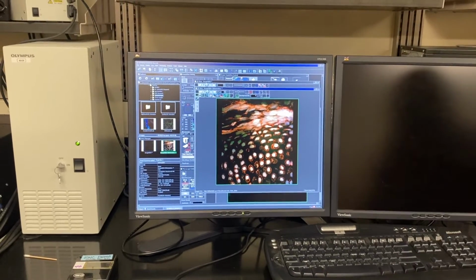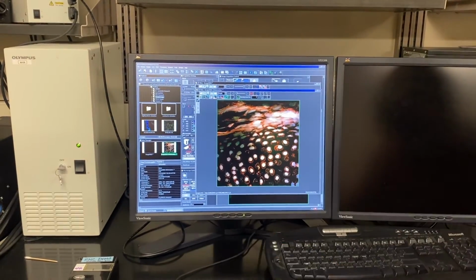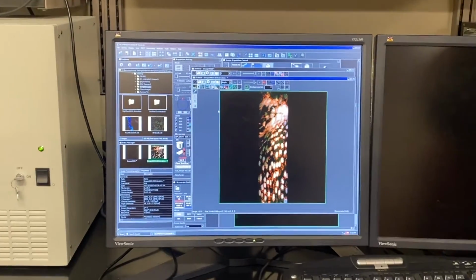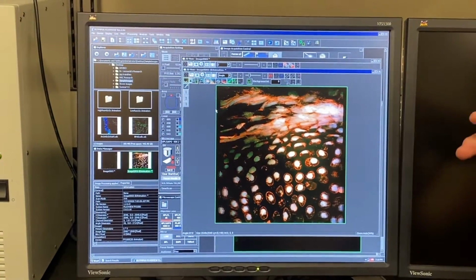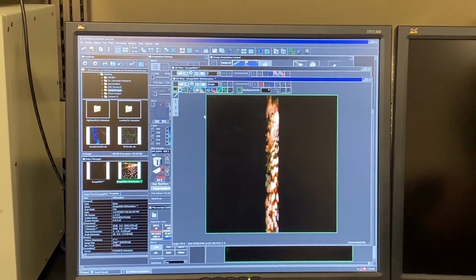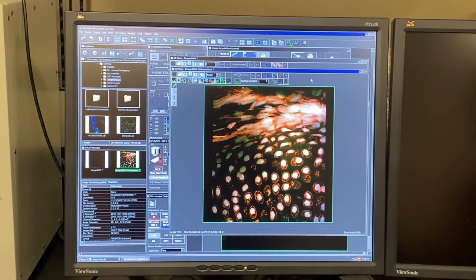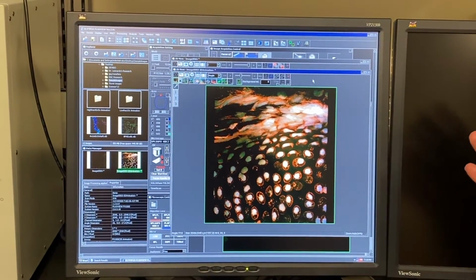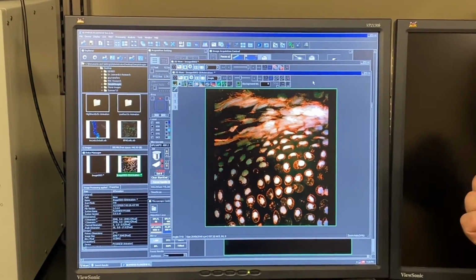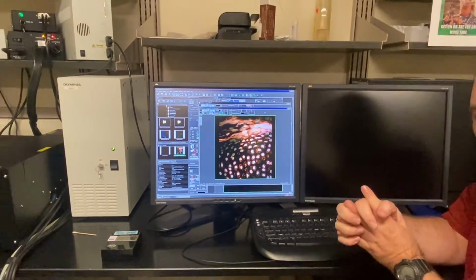And so we also used only a 40x lens. This microscope has 100x, and we didn't zoom at all. So we could have optically zoomed, and we could have looked inside a cell and taken a single cell and done a 3-dimensional image on it with 100 pictures through a single cell. So that's how to use the confocal microscope to take 3D images that you can tell what cells are on top and bottom, where's the blue, where's the green, where's the red, whereas you cannot tell that with epifluorescence.